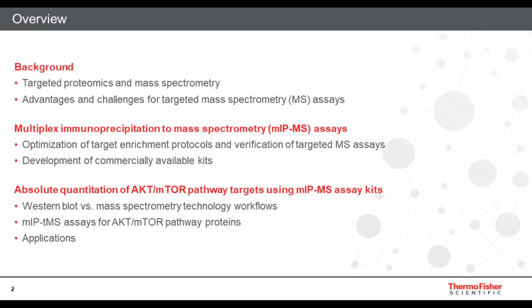We'll compare the Western blot method with this new IP-MS assay workflow, as well as how we develop these AKT mTOR pathway assay kits, and also talk about the application.